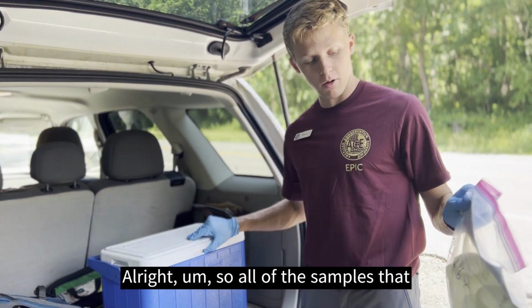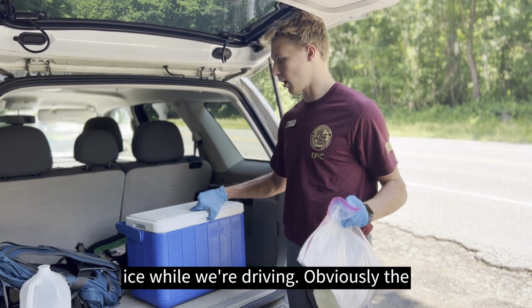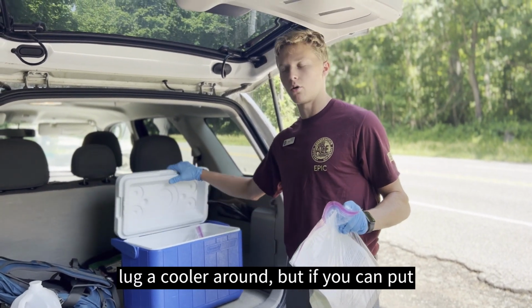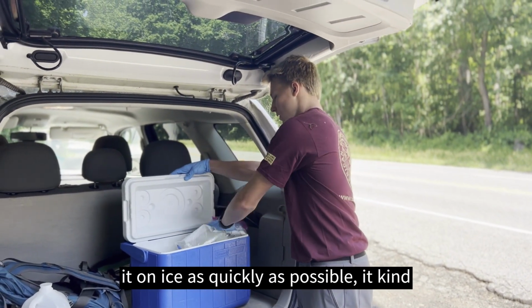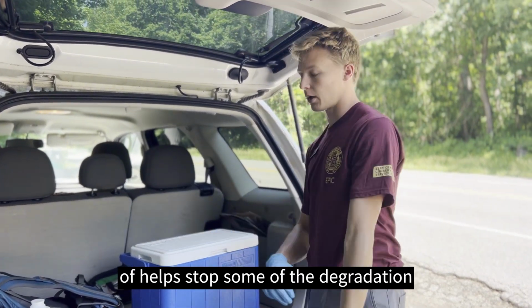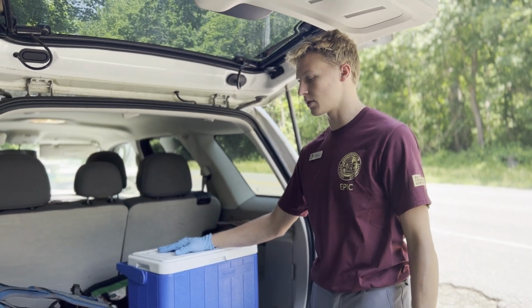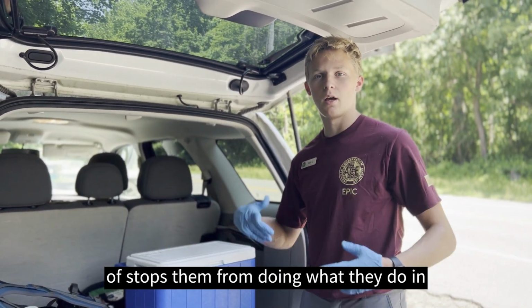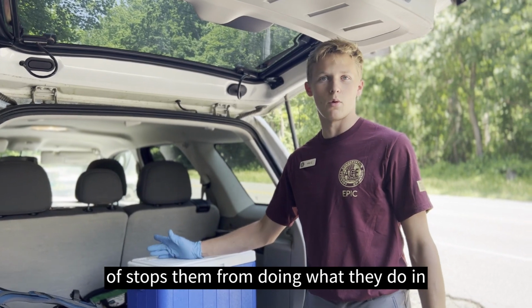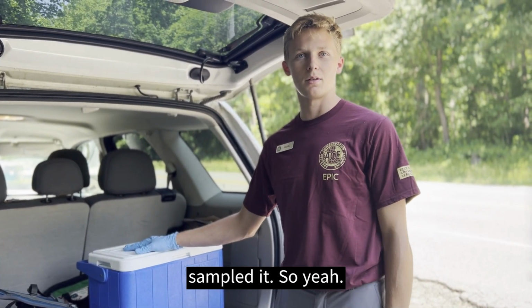All of the samples that we have, we make sure that we put on ice while we're driving. Obviously on the hike back you don't have to lug a cooler around, but if you can put it on ice as quickly as possible, it helps stop some of that degradation that heat can do, and cold also slows down the microbes and stops them from doing what they do in the water. So it helps keep everything the way it was when we sampled it.